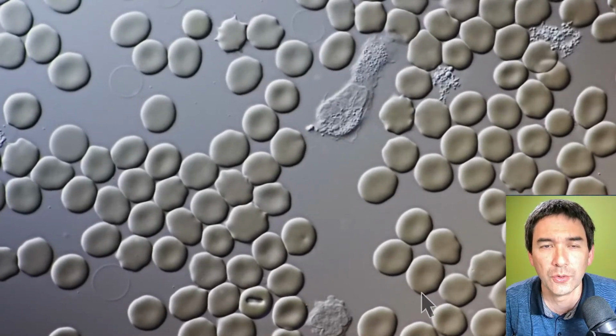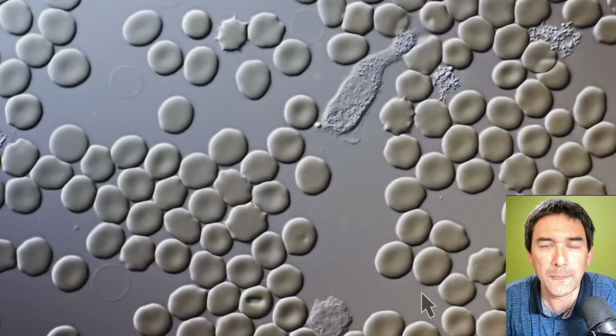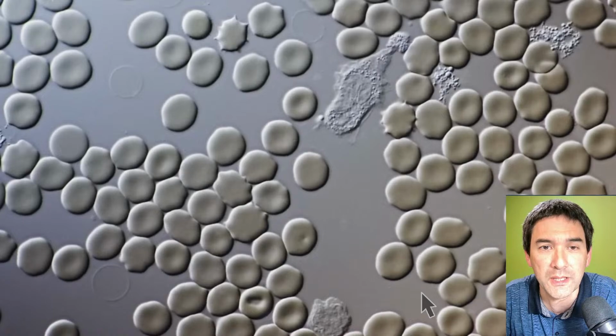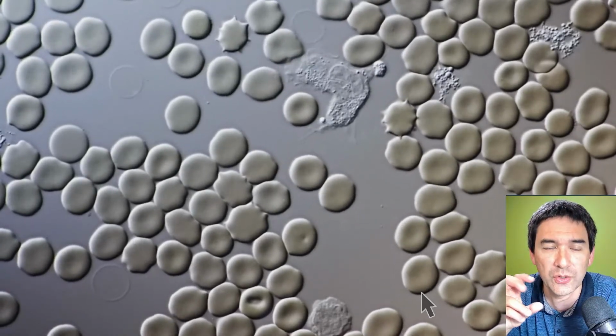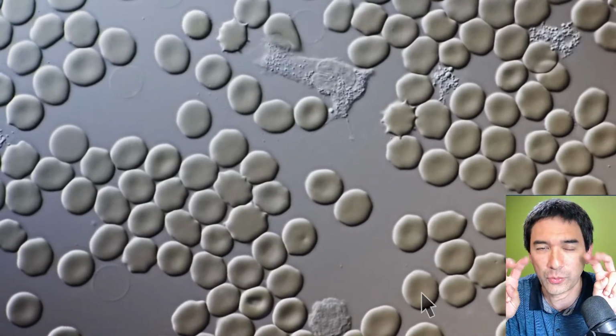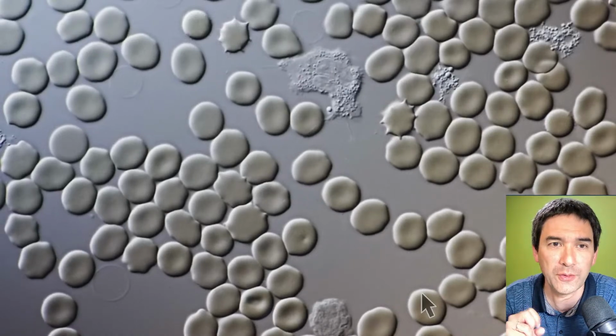I know on YouTube I've seen other videos as well where those white blood cells, those phagocytes, were able to follow some bacteria around because they're able to sense the chemical trail. So they're able to, under quotation marks, maybe smell bacteria, and they're able to follow them, and that's how they're able to catch them.